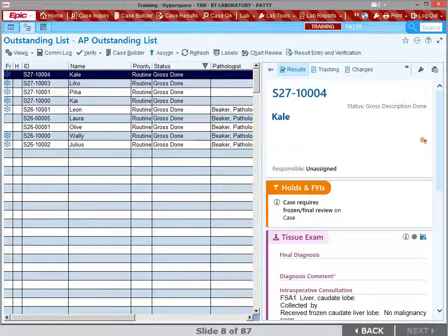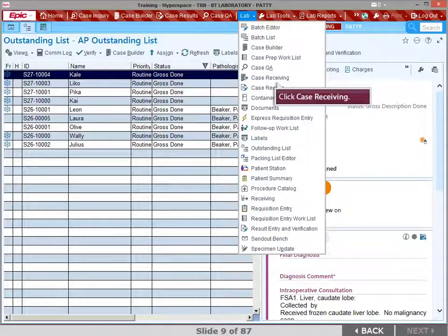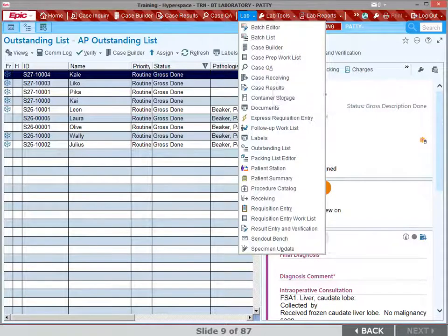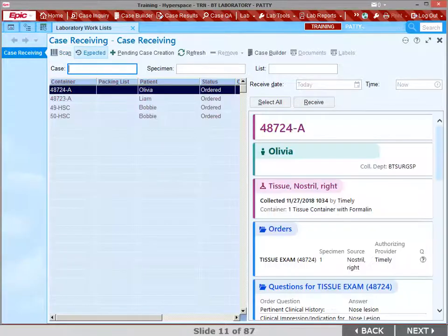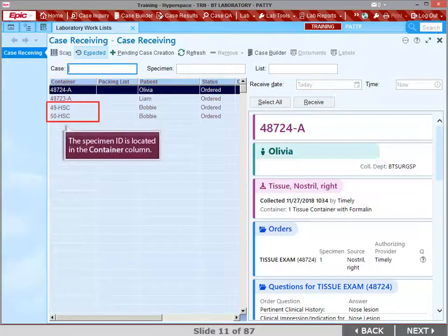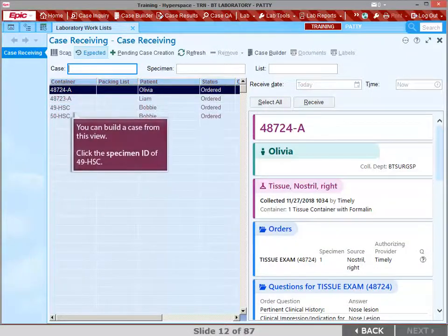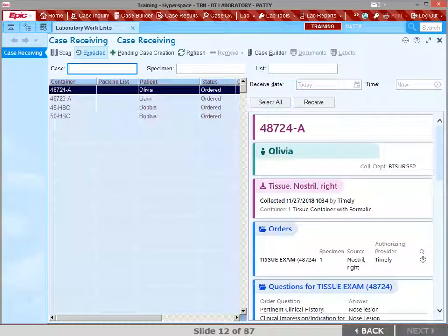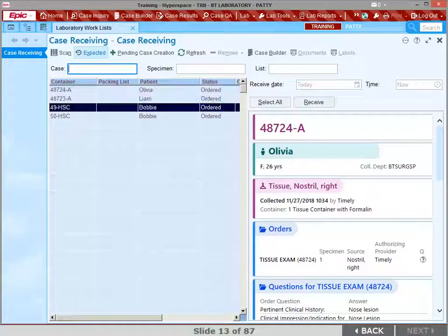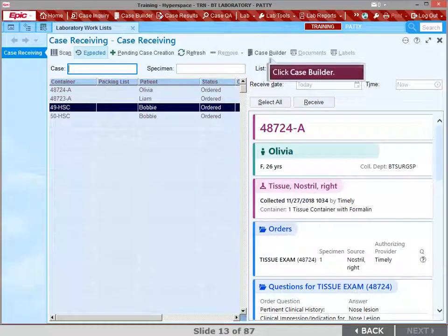Click Lab in the Epic Main Toolbar. Click Case Receiving in the drop-down list. Click Expected in the Case Receiving Toolbar. The specimen ID is located in the Container column. You also can build a case from this view. Click the specimen ID of 49HSC. Click Case Builder in the Case Receiving Toolbar.